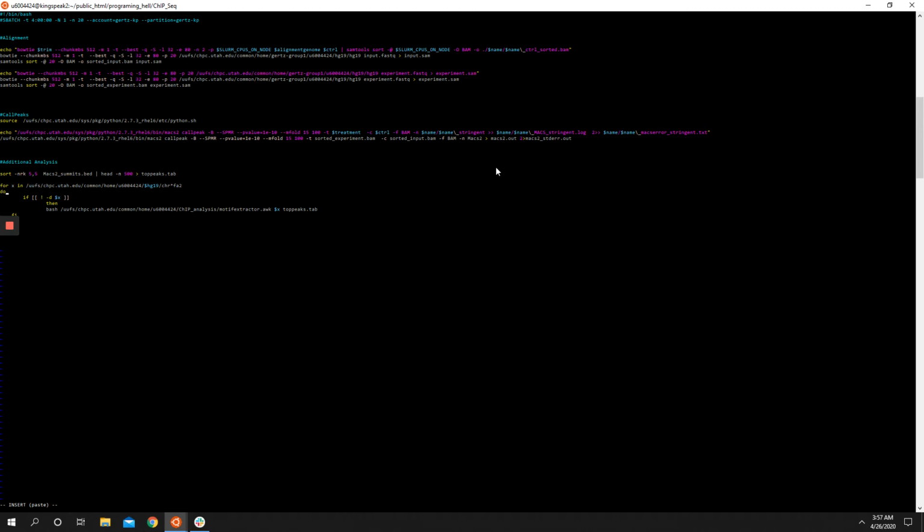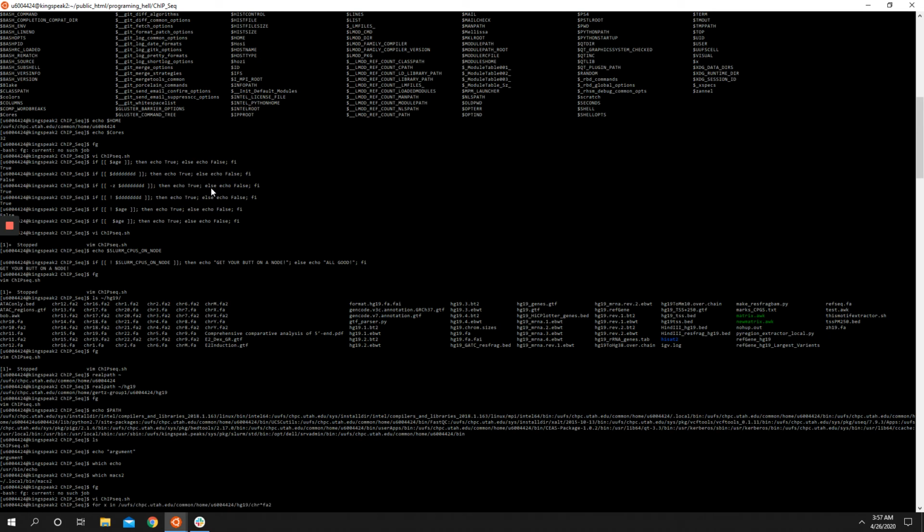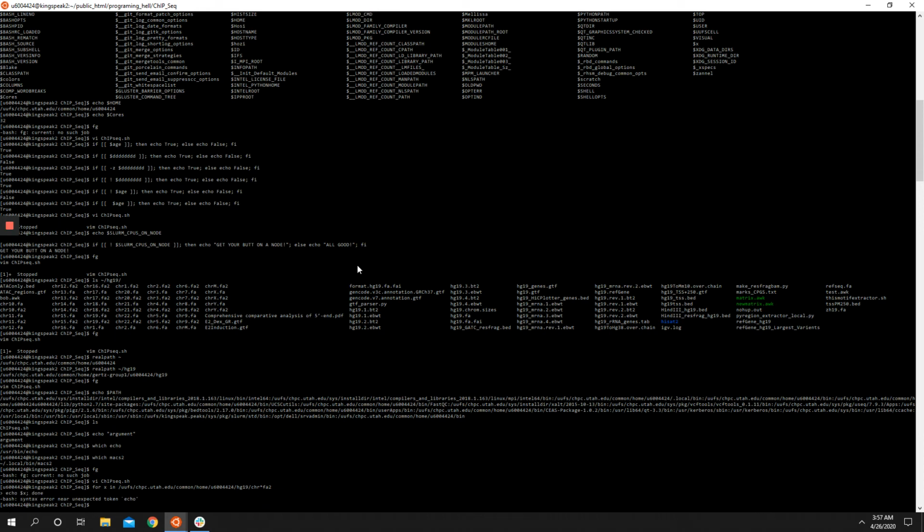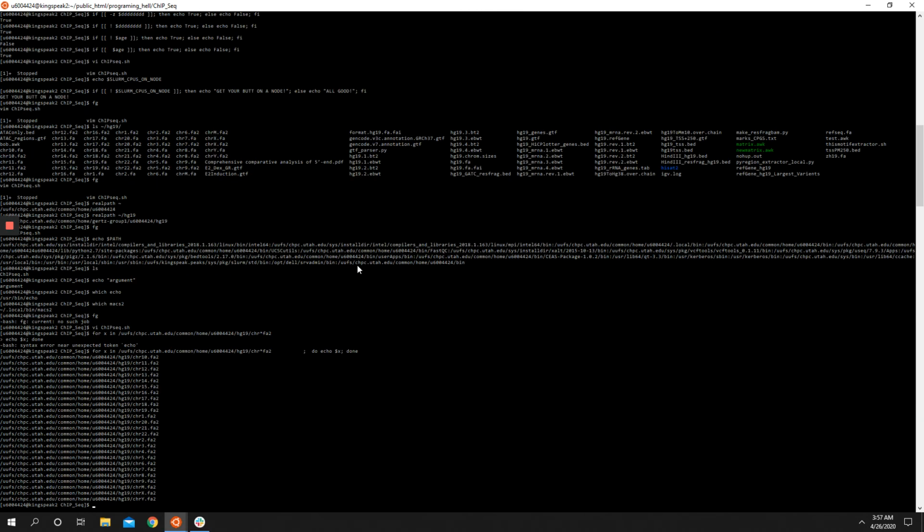So here, just to give you an example of what this is doing, we say for x in this. If I run this here, oops, gosh. All right.